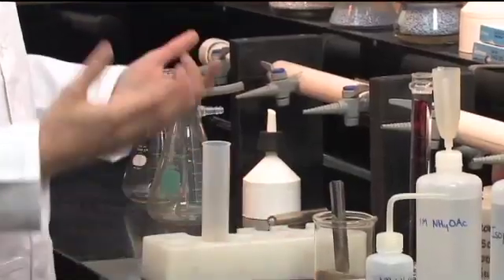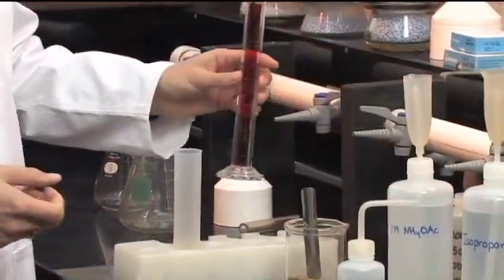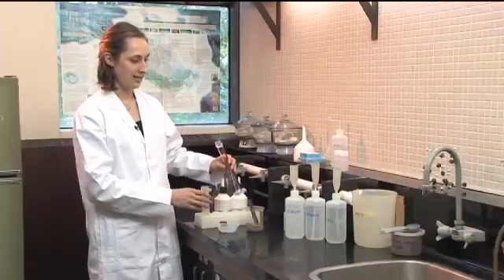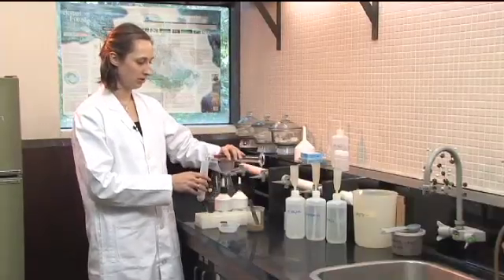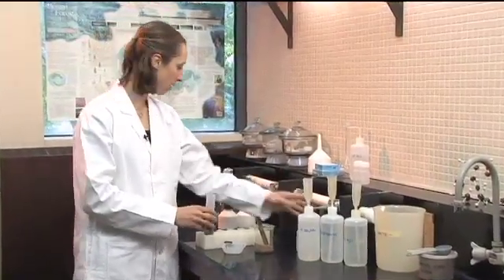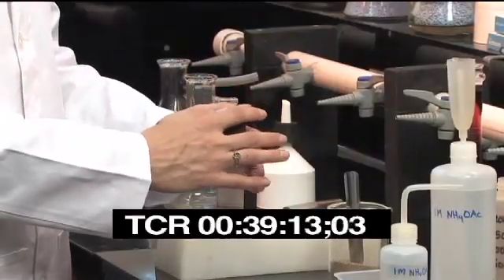I'm going to add my first extraction solution, which is the ammonium acetate. We're going to add 40 ml of ammonium acetate — it's a one molar solution. And stopper that up.